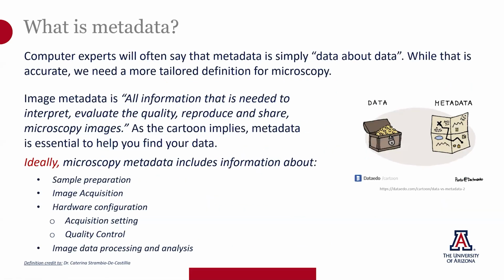So what is metadata? Computer experts would say that metadata is data about data. While that's true, we often need a more tailored definition for microscopy. And one definition might be all information that's needed to interpret, evaluate the quality, reproduce, and share microscopy images.